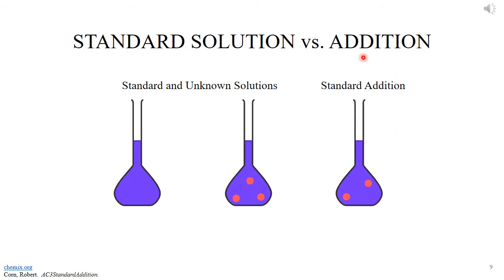However, standard addition does take these interferences into account. Each standard addition solution contains the same amount of the multivitamin solution, which means that each one has around the same amount of interferences. Thus, standard addition is more accurate in determining the amount of riboflavin in a multivitamin.